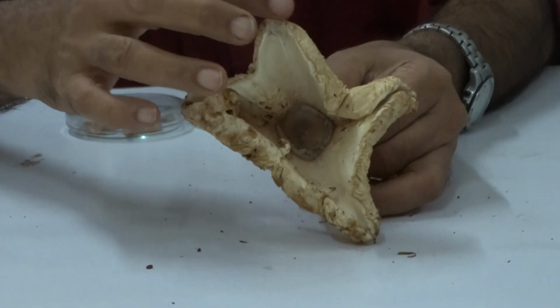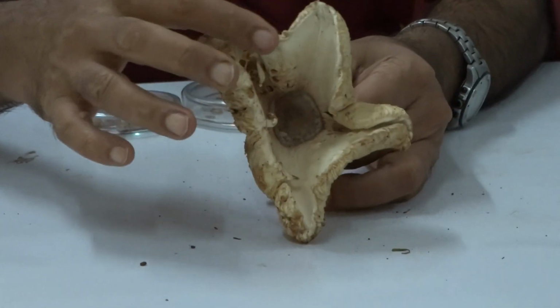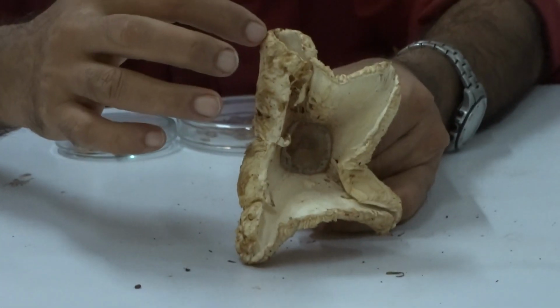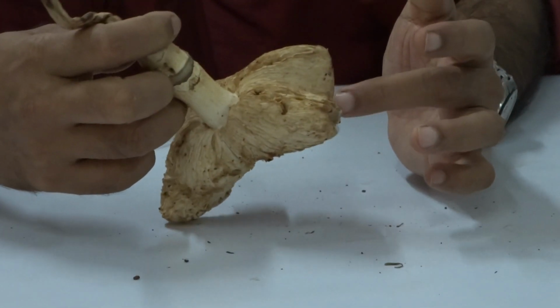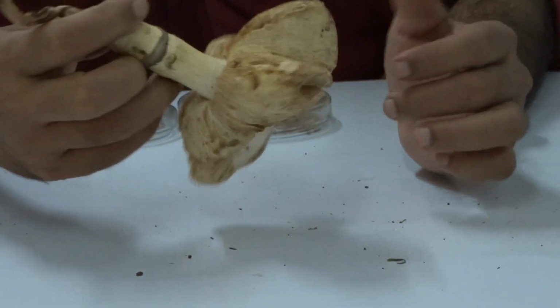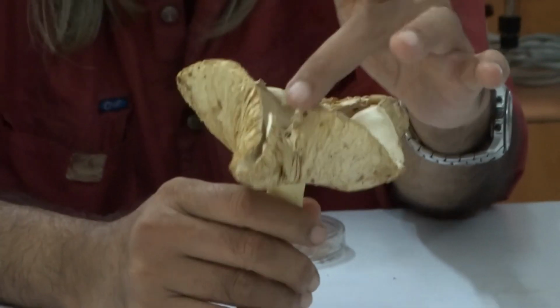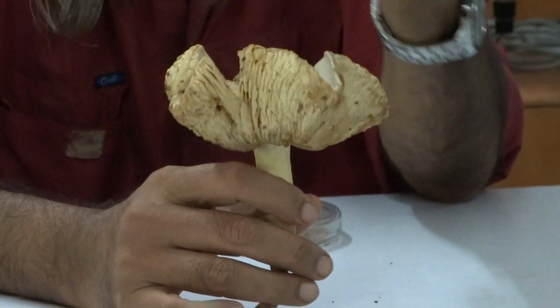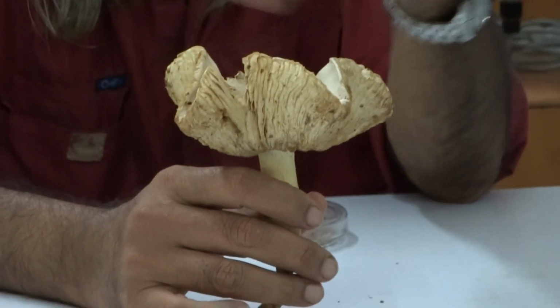Here there is no crack, there is a very smooth folding here. Then there is a very smooth folding here, there is very smooth folding here, there is no crack. You can see the margin of the gill is intact, except in this place where it has cracked. So the stress was very heavy in this area. So what it means is, biomechanically speaking, the context doesn't behave in a uniform or isotropic manner.